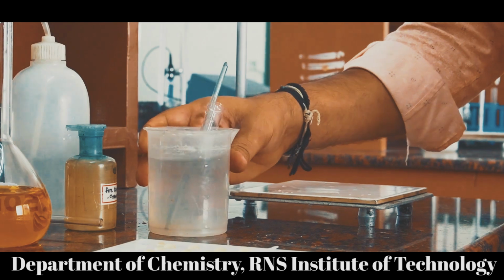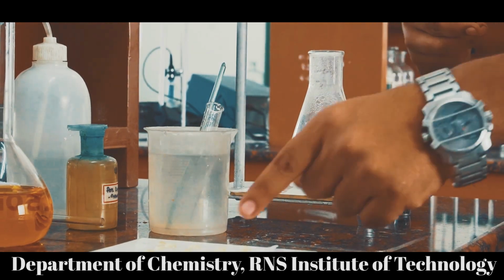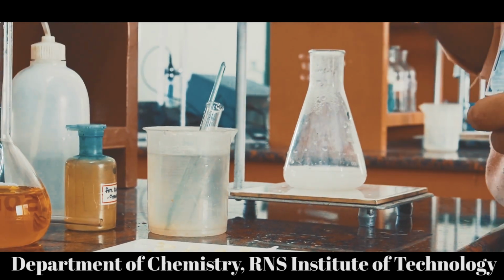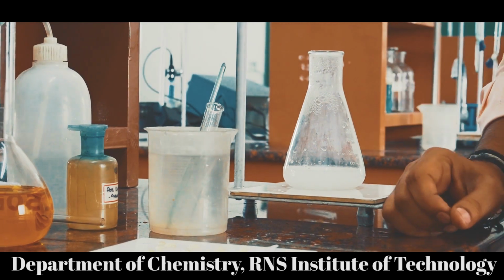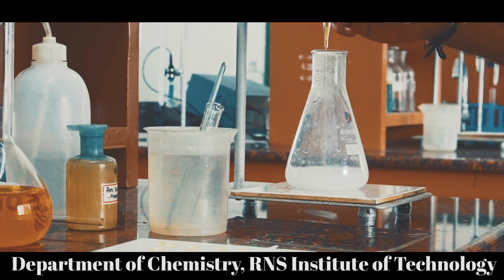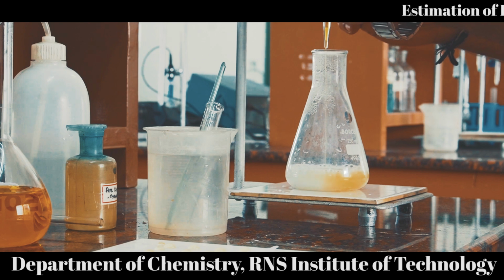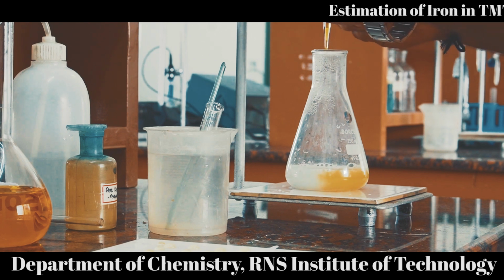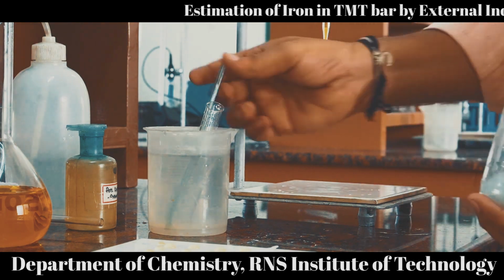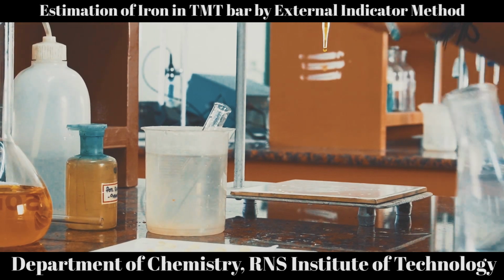So we have to keep all these things ready, and then we have to start the titration. As for the first trial, we know the range, that is it comes at 13. At 13 ml the indicator fails to change its color, so because of that reason now up to 12 we can add fast, right? We can straight away add up to 12, and after that we can go dropwise, that is for every 2 drops we have to stop and check in order to find out the accurate end point. 12, right? And then stir the solution like this.